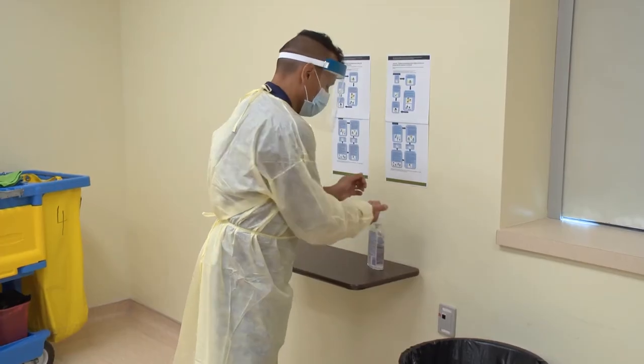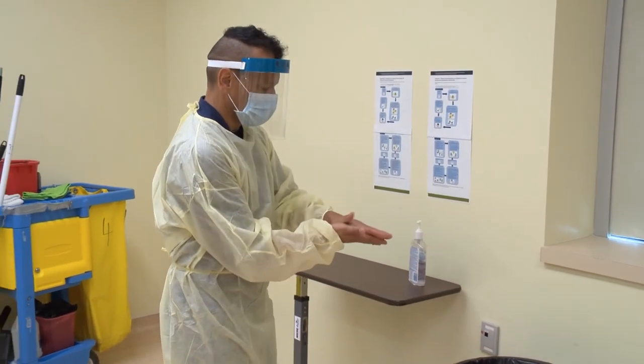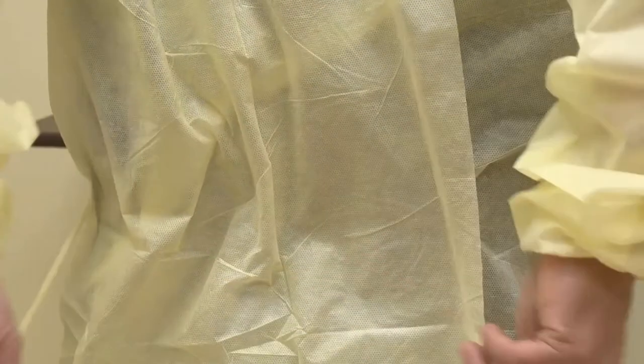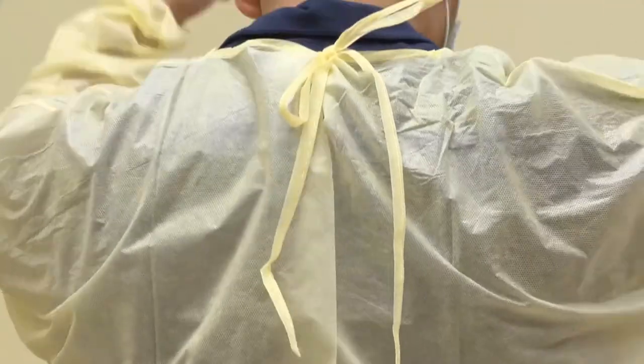Be careful not to touch the cuffs or sleeves of your gown, as they are potentially dirty. Next, remove your gown by undoing the waist ties, then the neckties.